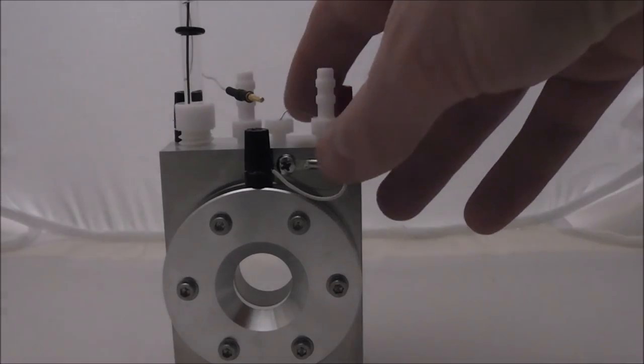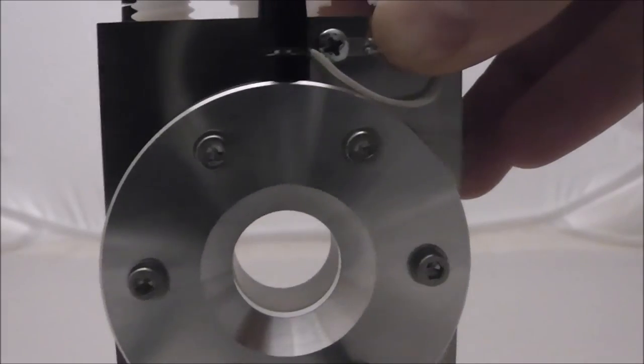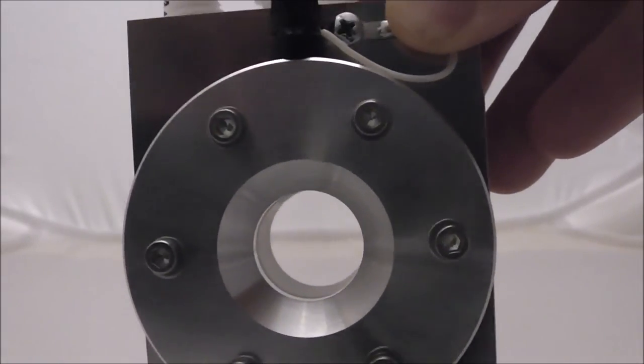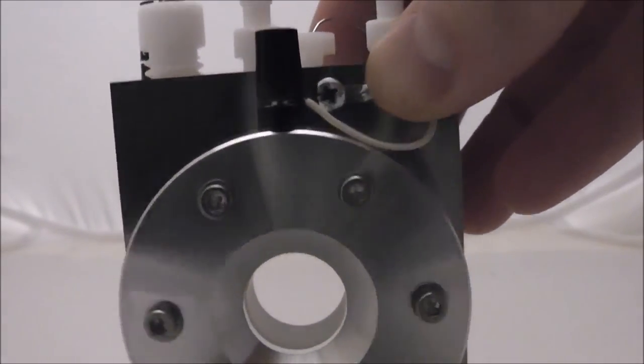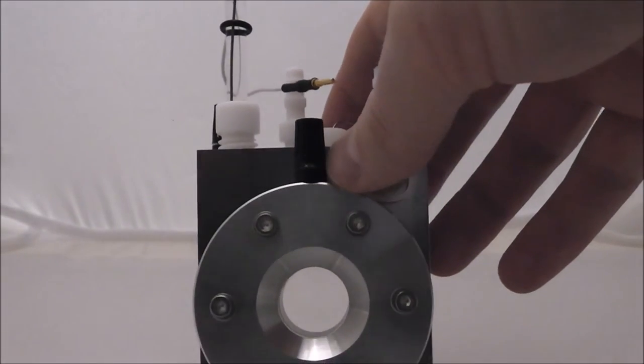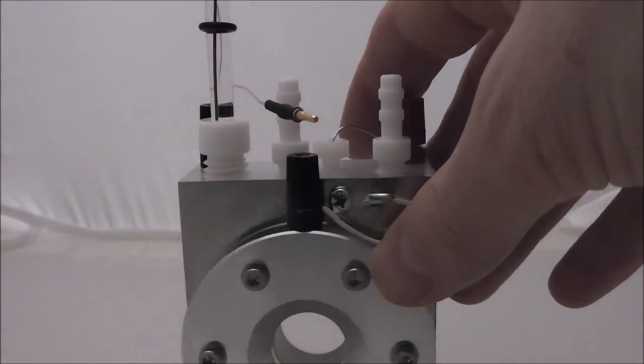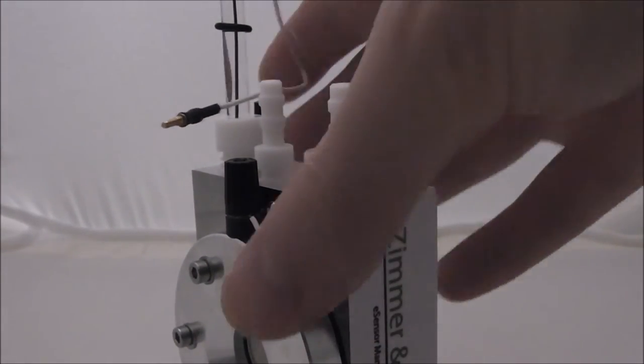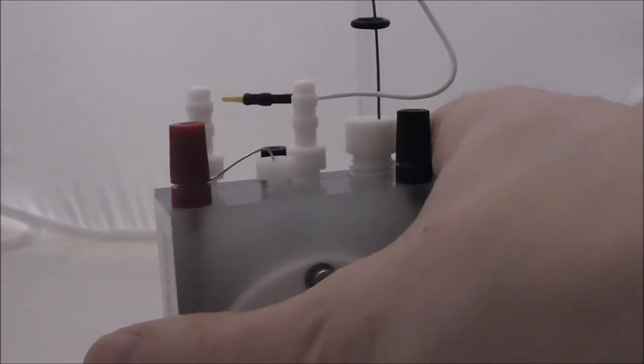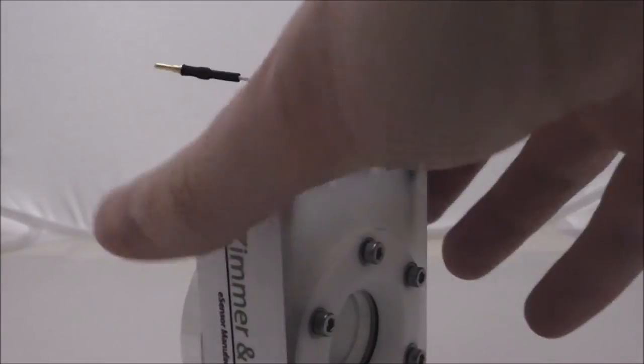In summary, there's a cell which you can fill with your electrolyte and electrochemically active components. Into that, there's a platinum wire connected to your counter-electrode, a reference electrode that comes with it, and you can put your working electrode in there and make good electrical contacts. The whole cell is grounded, if you wish it to be.